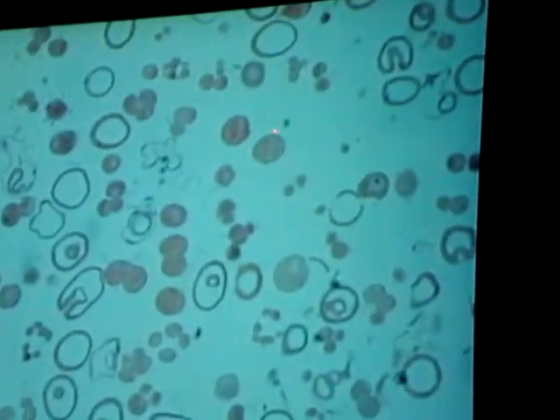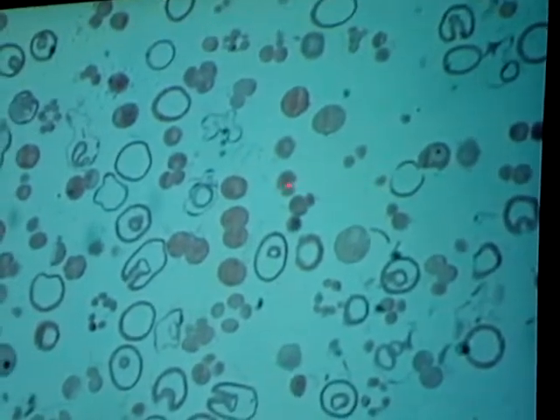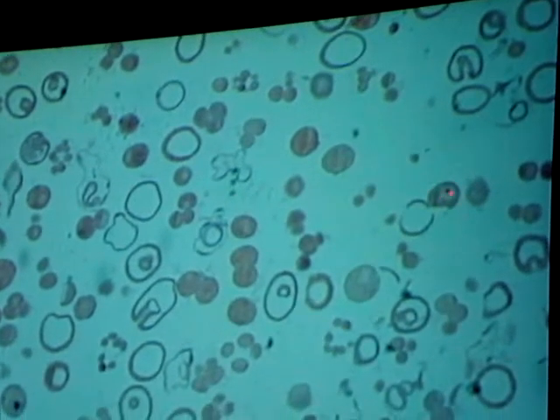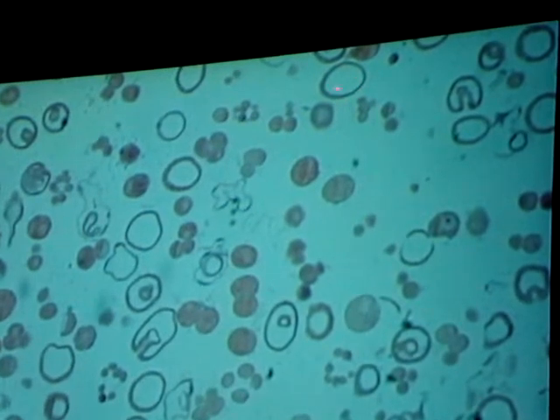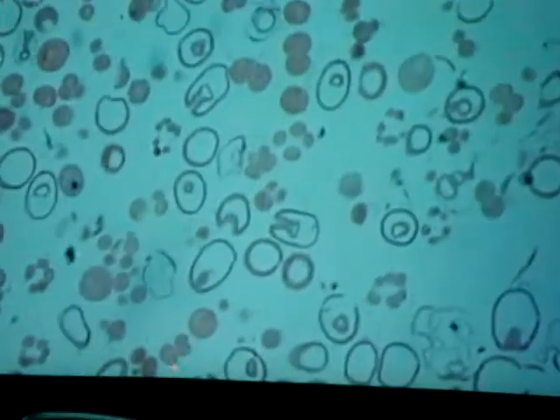All right, that one? Fertilized. This one? Two-cell stage. This one? Unfertilized. That? Blastula. What's the space? Blastocoel. So blastula, blastocyst, and the blastocoel is the space. And those can be spelled all different ways, so I tried to give as many spellings as I could on there. Possibly that one. Four-cell stage.